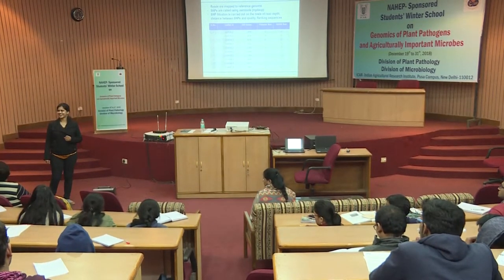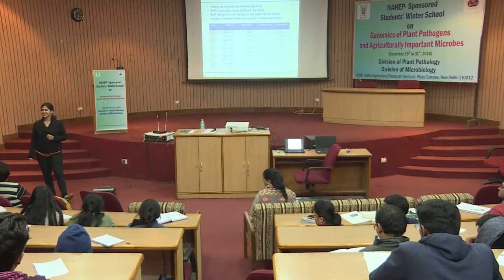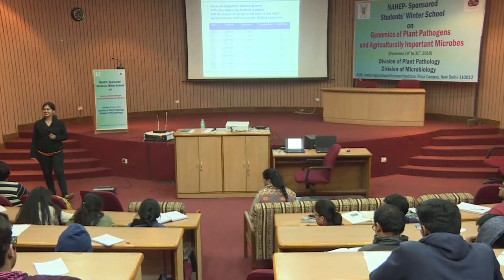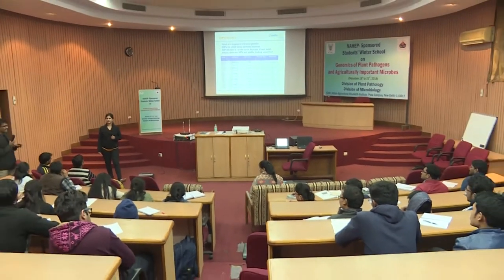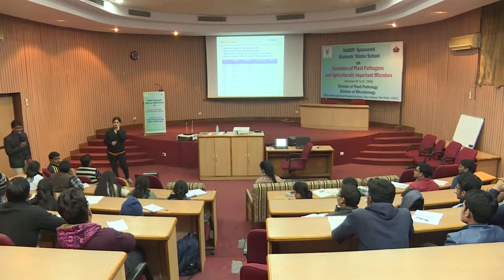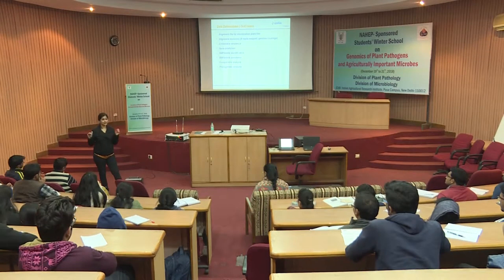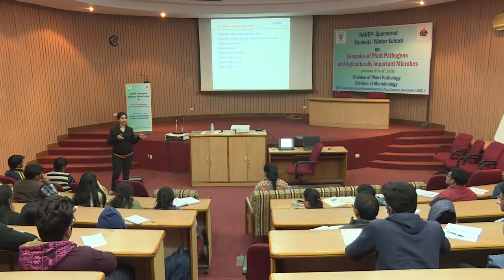Yeah, this point is very important. SNP calling is the hot subject nowadays. So, consensus of accuracy really. She was telling 14 of them are pointing towards A and they will call A the genuine SNP. So, the SNPs which are there will be evident enough in your consensus sequence, that is, what is the sequence of your genome.